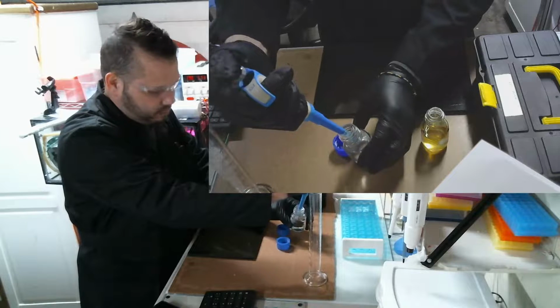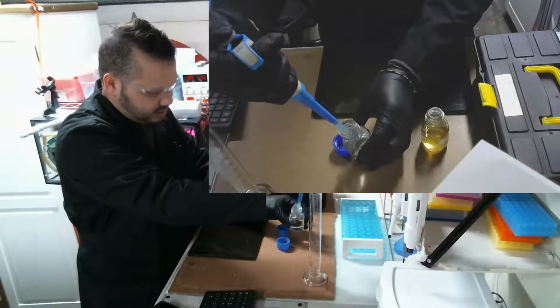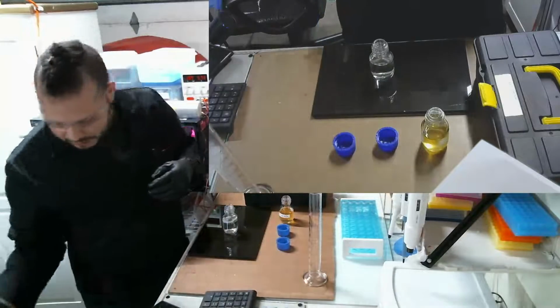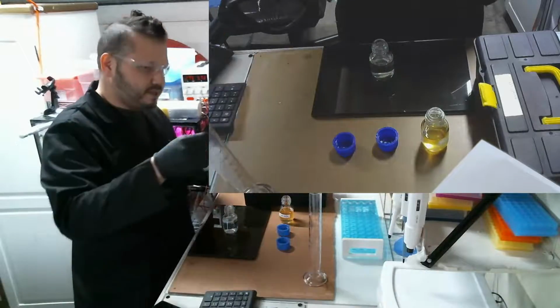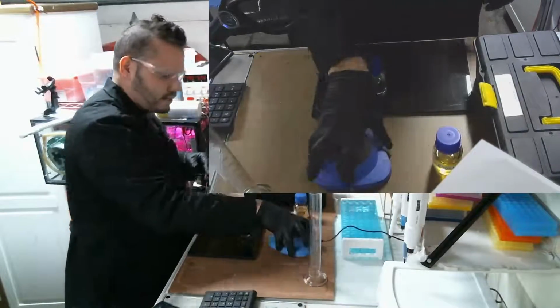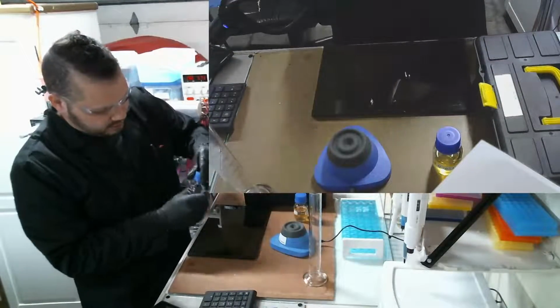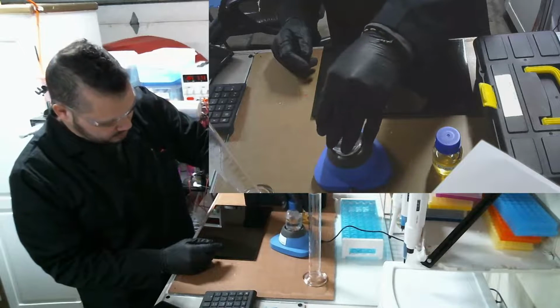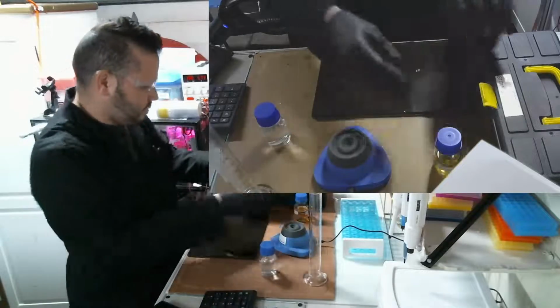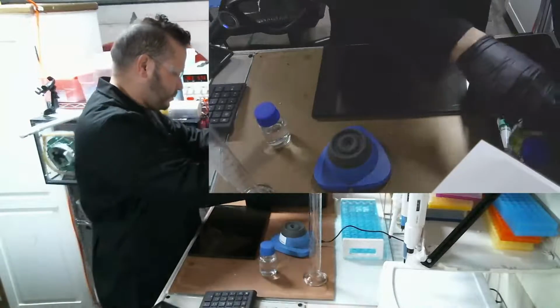I bring it back and forth a couple times, and what that does is it allows as much of the hormone that might be stuck on the side of the pipette tip to mix in with the water. And then now I get the vortex mixer. Mix it up. Put this one away.